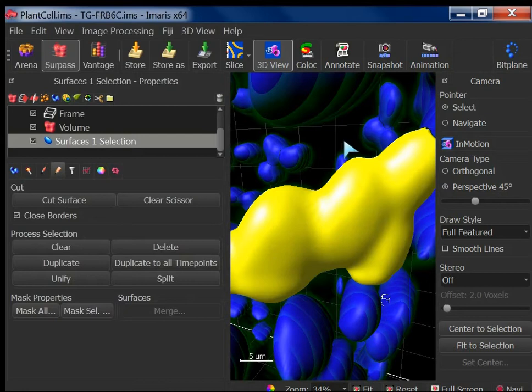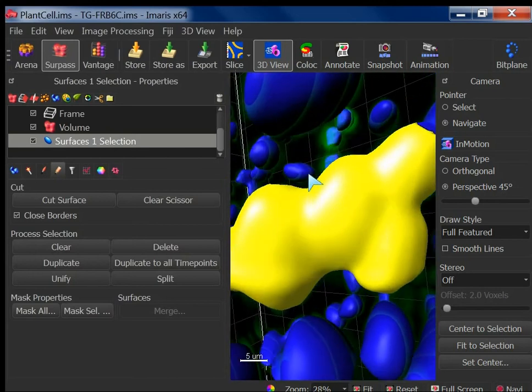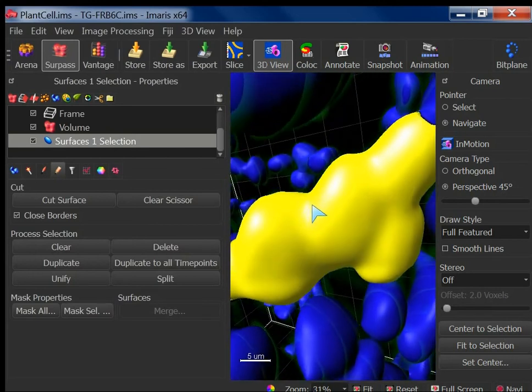Sometimes you will get this message, right? Maybe this is so perfect. But always with the Dunstan data, we always get such a warning. Because this is a very easy data set, right? I mean, you can see nicely, there's a clear nuclei.